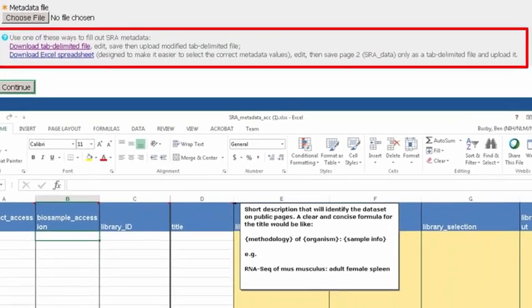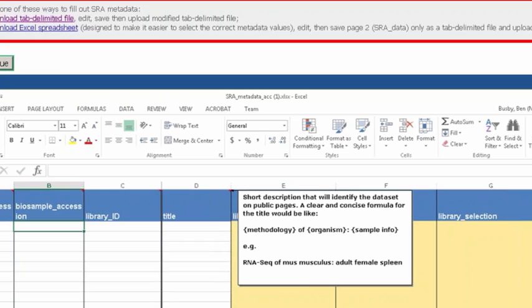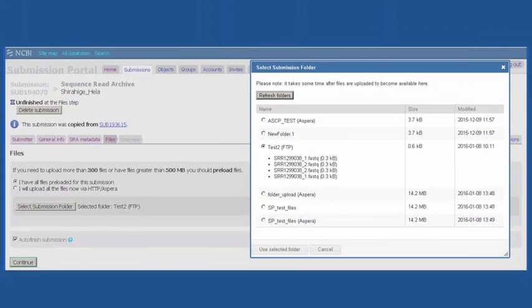Here we can see the Excel spreadsheet that can be downloaded from Submission Portal. If you mouse over some of the descriptions, boxes will pop up describing exactly the information that's necessary to complete the submission. Finally, when you go to Submit Data Files, it will bring up a directory and you can select the appropriate files to submit.